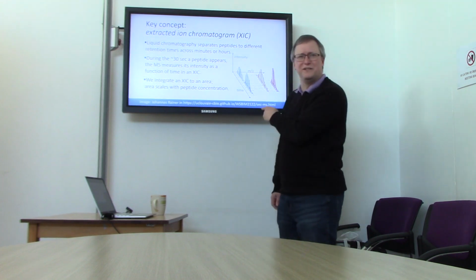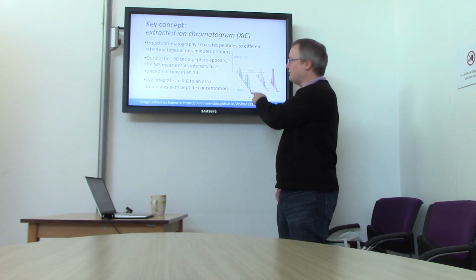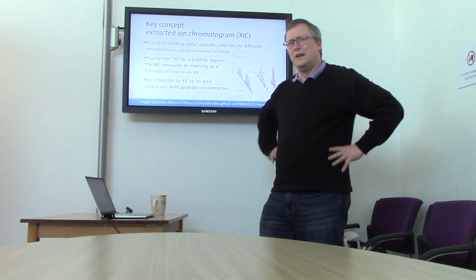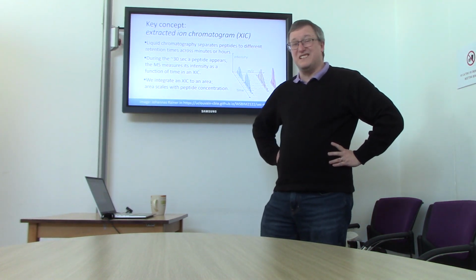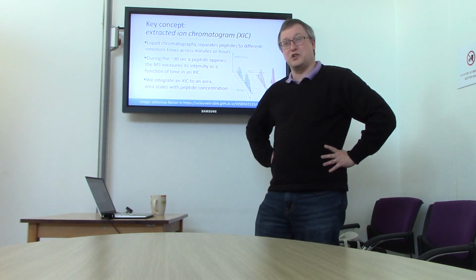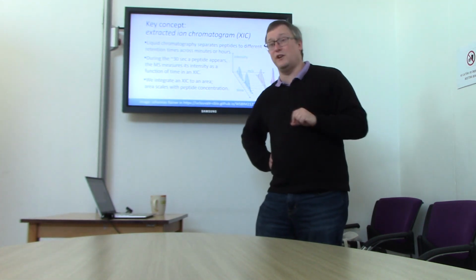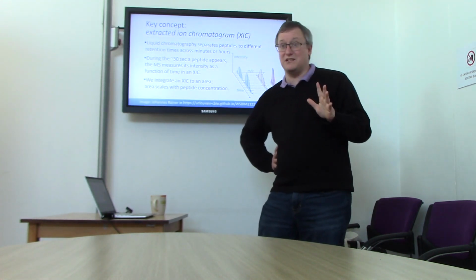But look at this blue one. It's a little funky, isn't it? We've got a rise and a fall off, and then it re-rises and falls off, and they're both colored blue. Now, are these in fact the same peptide? Could they be two different peptides that show up right after each other in retention time at very similar mass to charge values? Could be in some cases.